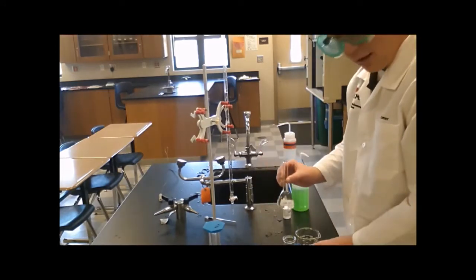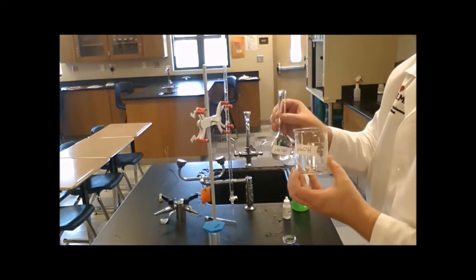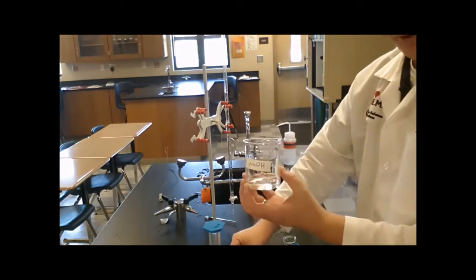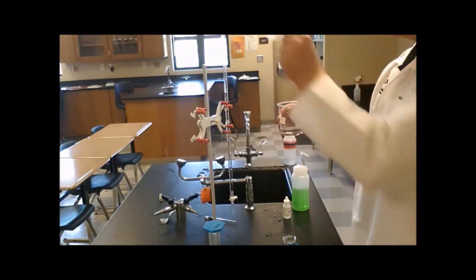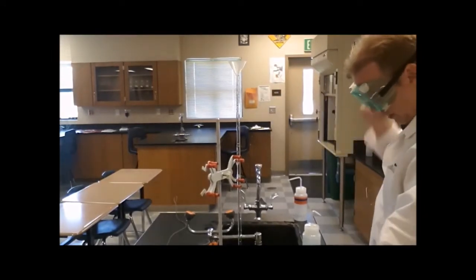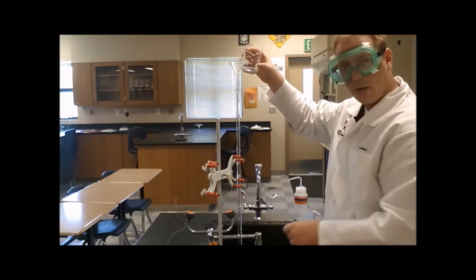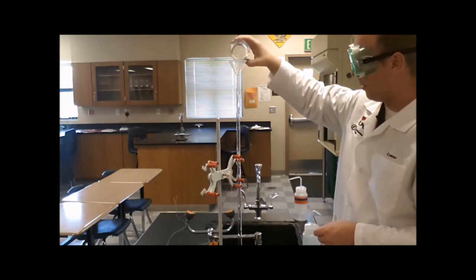How much sodium hydroxide? Everything is nice and labeled, so I know exactly what it is. They all look like clear liquids, so if I don't label it, I won't remember which one's which. I'm going to load the sodium hydroxide into the burette via the beaker, because it's got that nice lip on it. If you want, you can use a funnel. Of course, the funnel had better be clean too. So I take the funnel, put the funnel on top, take the sodium hydroxide, add it to the burette. By the way, make sure the stopcock is closed when you add the sodium hydroxide to the burette. Otherwise, it'll start pooling out down the bottom.